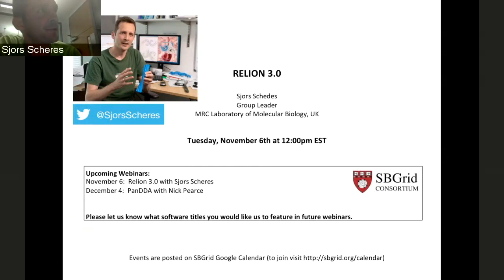If you have high symmetry and you want to maintain that symmetry, you're imposing that all the different bodies will flop. They have some motion with respect to each other. Otherwise, you wouldn't do multi-body refinement. So if you want to still refine multi-body in a high point group symmetry, then your basic assumption is that all the motions still obey that point group symmetry, which may very well not be true.